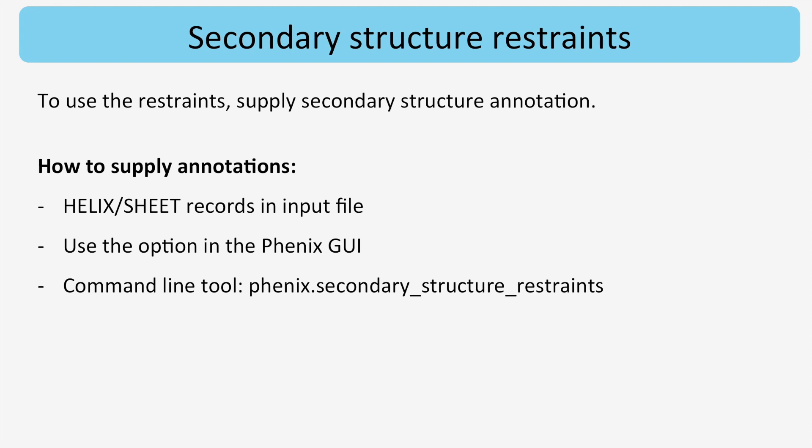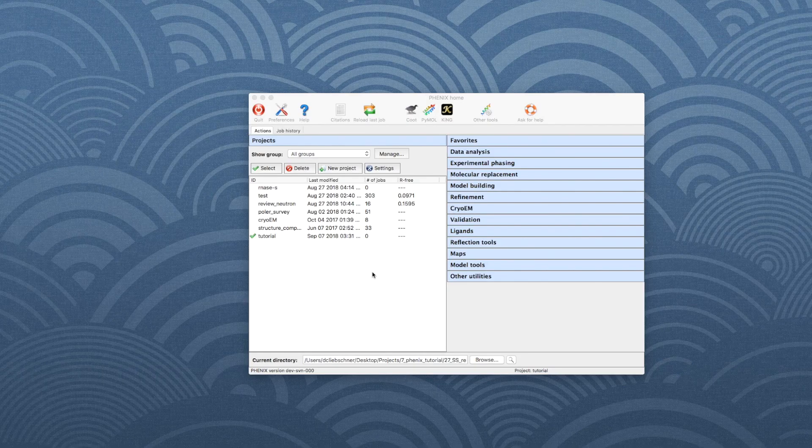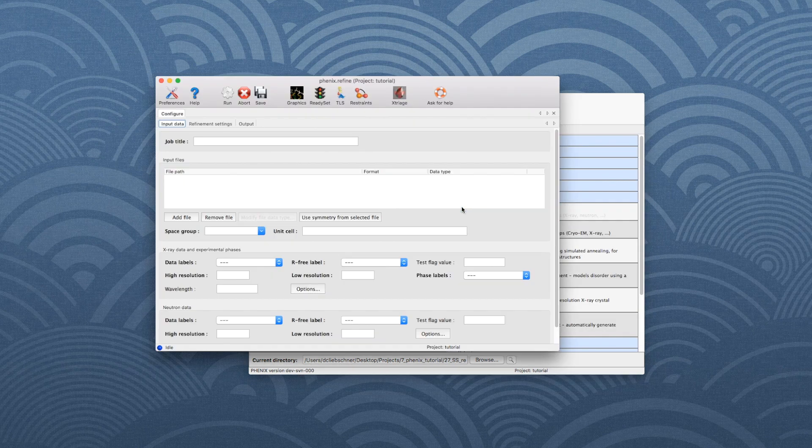Now I will show how to obtain annotations in the Phenix Refine GUI, and afterwards where to enable secondary structure restraints for Phenix RealSpace Refine. In the main Phenix window, click on Refinement and choose Phenix Refine.